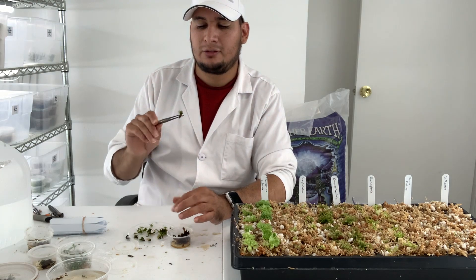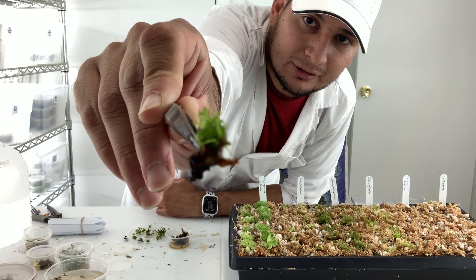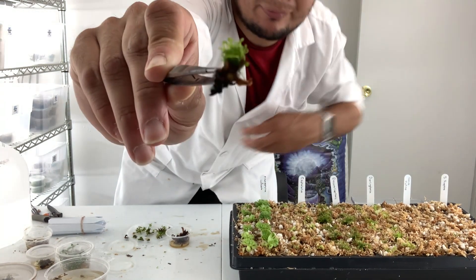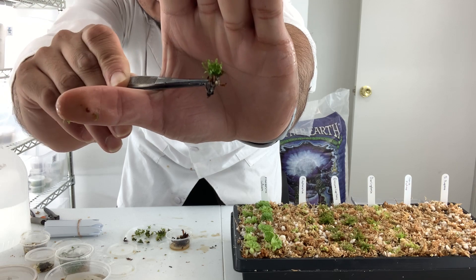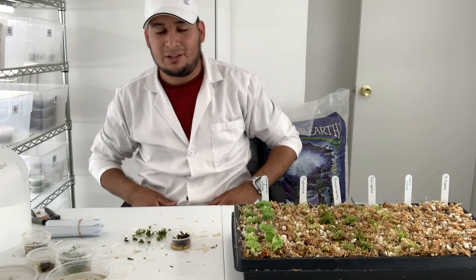Let's see — this is hyperhydration here. It's not going to make it; this is dead or will be dead soon.